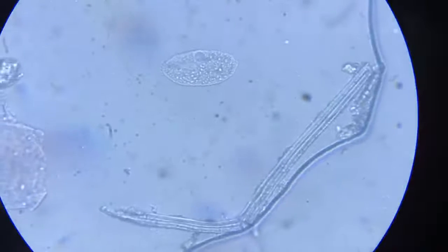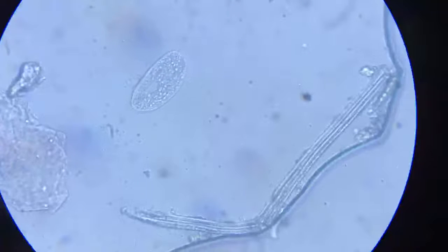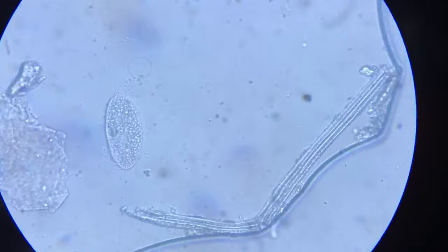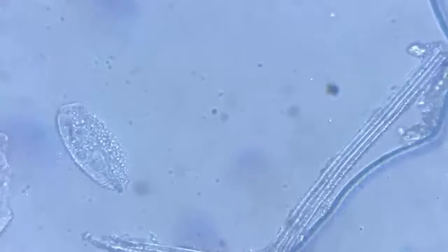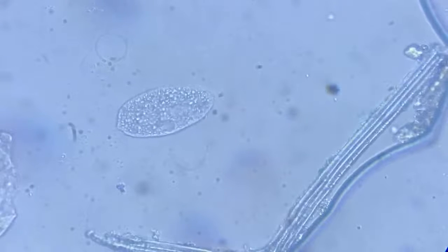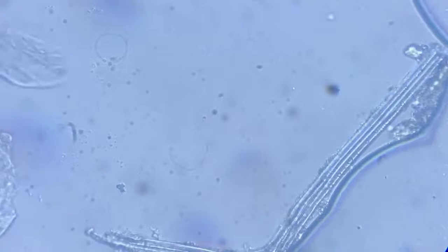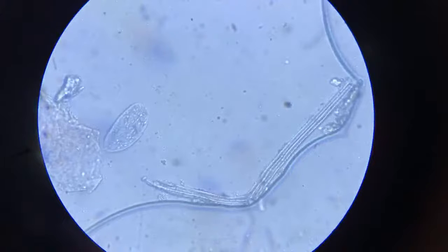This apparently will be a safer zone, though not for long, because this little filament will hold that water layer for some time and won't let it crush those animals. It will take a while. As you can see, the cohesive forces will retain this water film here for a long time. But you cannot expect it to last very long, because it's closing in from the other sides, as we see.